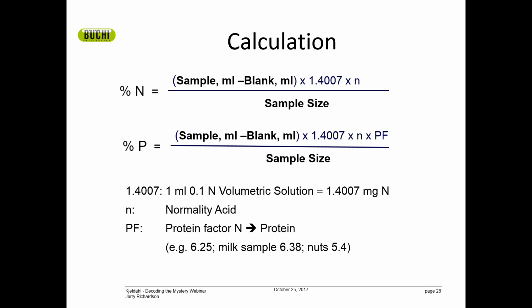And so basically we're looking at the same exact process, whether it be water, wastewater, or whatever else, along with anything that's food, feed, biological. We may handle the digestion a little bit differently, but the distillation is commonly very similar one to another, and we just take into account the differences in the math.